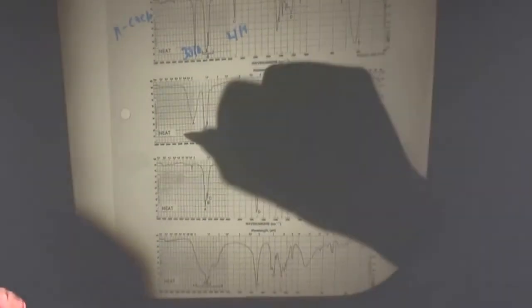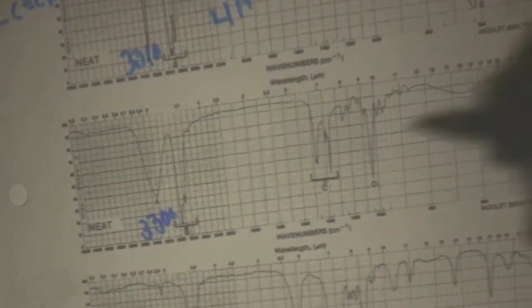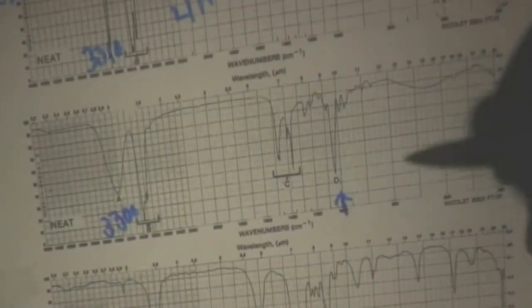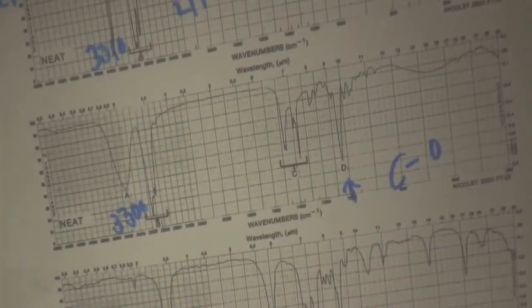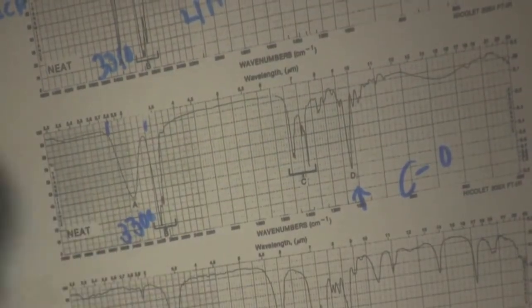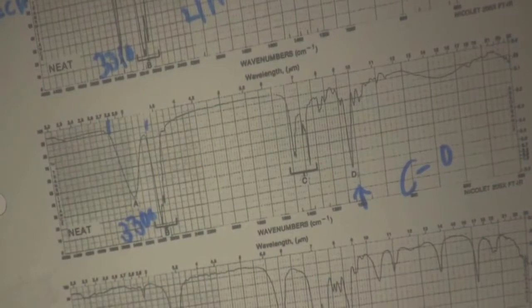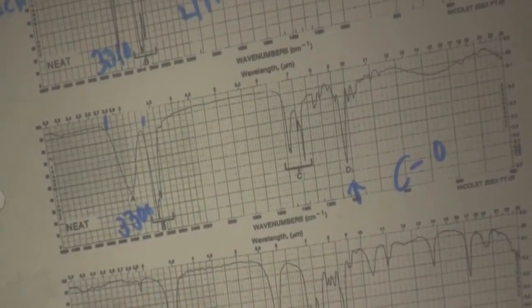Small alcohol, so we have this band at about 3,300. Here in this small alcohol, you can see your C-O single bond stretch. And again, the main thing I'm looking at is that this is sort of picking up and coming down. All right, any thoughts or questions on this one?